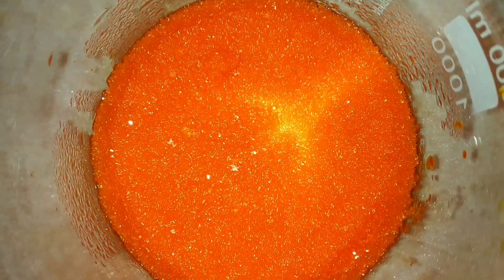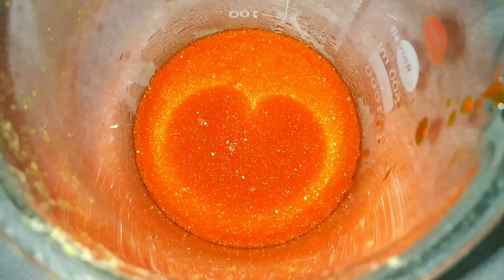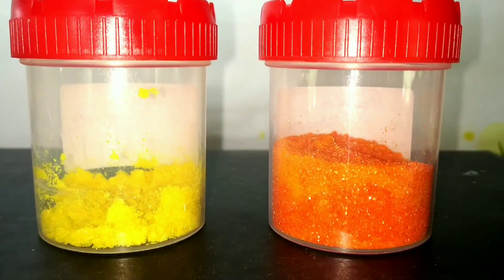On cooling, crystals of potassium dichromate separate out. I have already made some excess potassium dichromate with about 20 grams of potassium chromate which I had made earlier before recording this video. Now allow it to dry and then transfer it onto a tissue paper to dry completely. After drying completely, pack them both — that is the potassium chromate and dichromate — in airtight containers and label them.